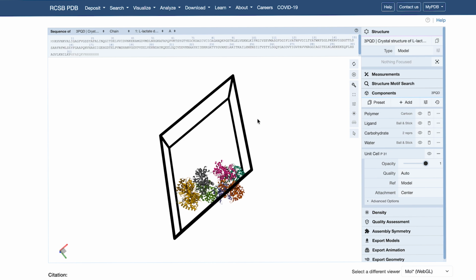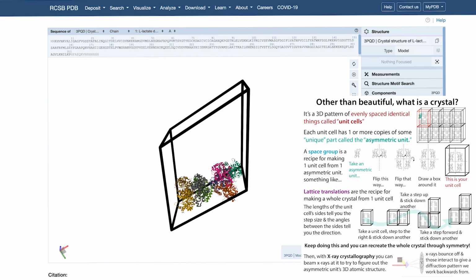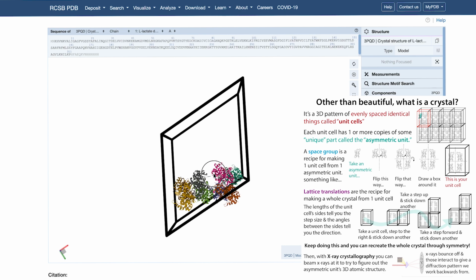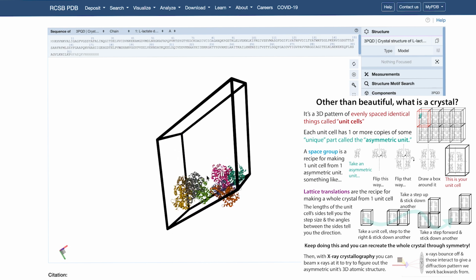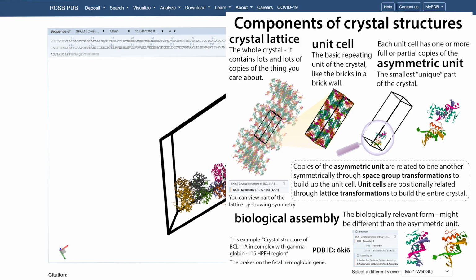This isn't always true, but sometimes it is. The reason is that there can be differences in crystal packing and so on that make it so that they're making different contacts with the thing next to them, which might squish it a little bit in one area, or make it slightly different. Sometimes they have different occupancies, so if they're bound to, say, a cofactor, or maybe some other thing, like a metal, it could be that in some of the copies, so in some of the functional units, it's missing in that form, and then in others it's not.